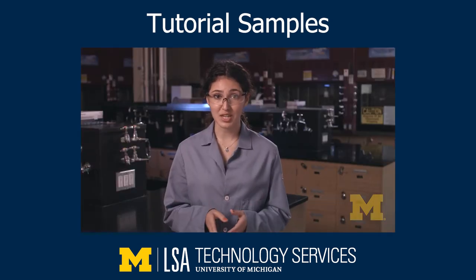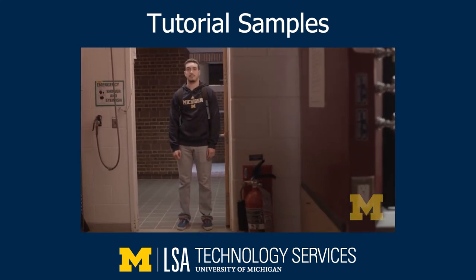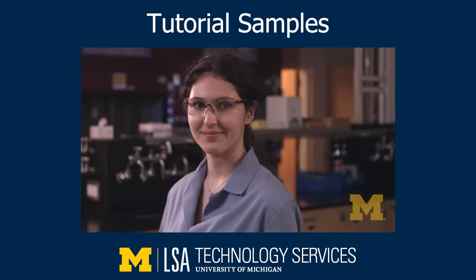Remember, the more skin you protect, the better. You must wear closed-toed shoes, long pants, and a shirt that covers your shoulders. We keep the temperature a bit cool in the labs to prevent you from overheating.